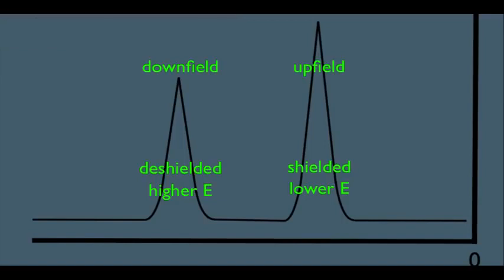So now, finally here, what does this NMR machine do for us? Well, let's just say you happen to have a sample. In this beaker is some organic substance. And let's say we take this substance right here and we run it through the mass spec. We learned how this machine worked in a previous online lecture, and remember, he had the ability to deliver not only the molecular weight of a compound, but also the possible molecular formula. And let's just say the mass spec happens to say that our sample is C3H7Cl.